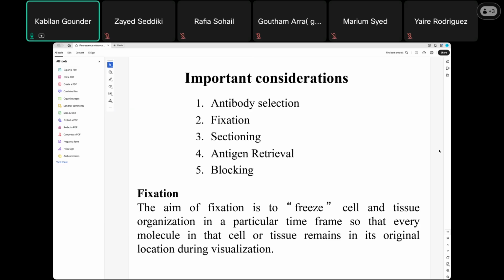So these are all very important for fluorescence microscopy. Even though antibodies are part of immunology, we use the antibodies to detect proteins and other components in this fluorescence technique. Our goal is to get clear images as well as fluorescence, that is, to see the proteins. For that, we have to handle the samples in the proper way.